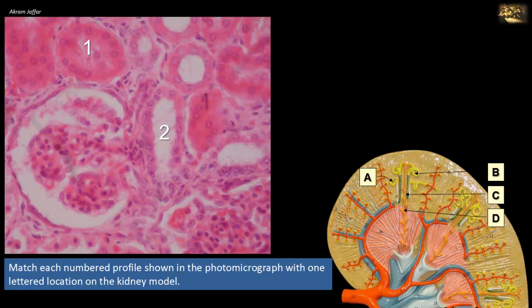Match each numbered profile shown in the photomicrograph with one lettered location on the kidney model. The photomicrograph shows a glomerulus, thus it represents part of the renal cortex, where we also expect to find proximal and distal convoluted tubules. The circular profile number one is a proximal convoluted tubule.